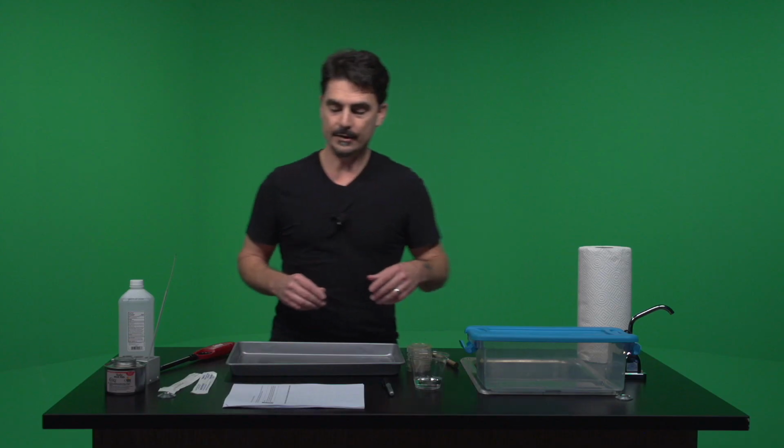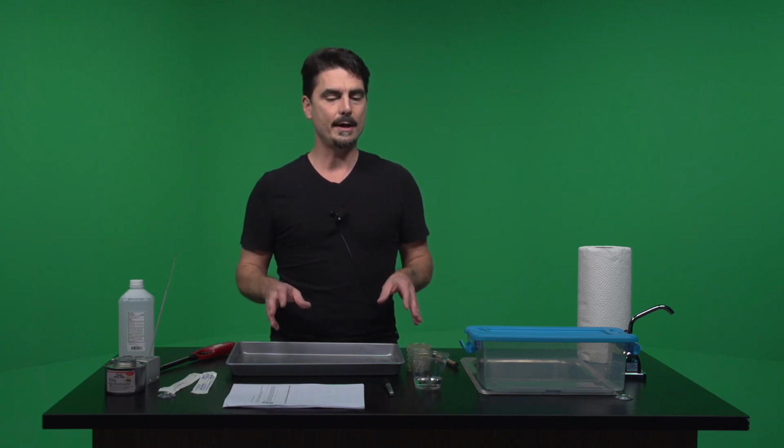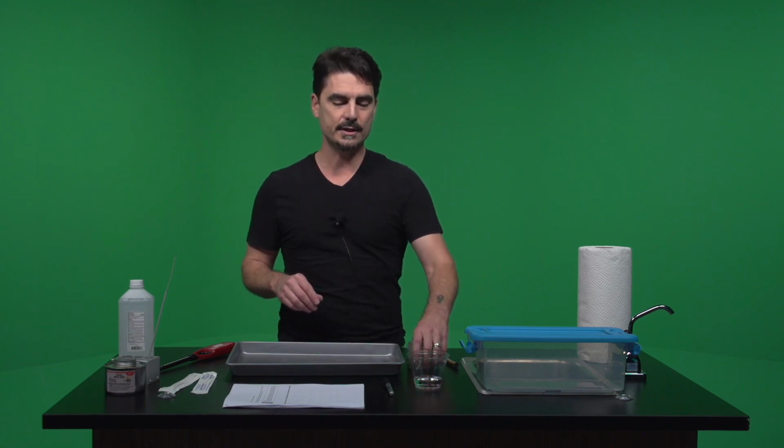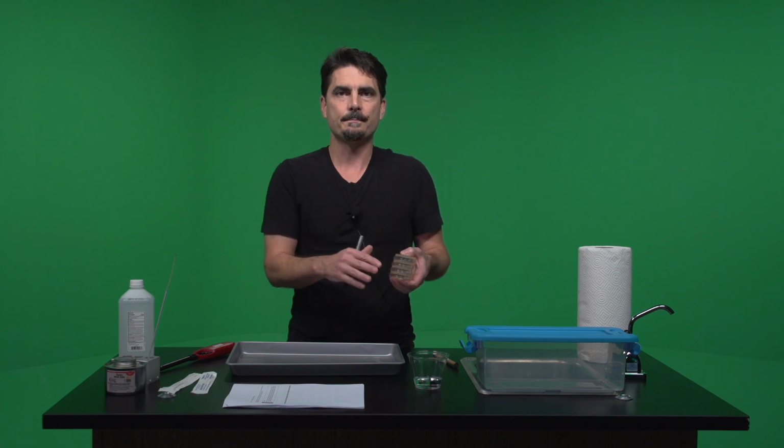Okay, so the next thing we need to do is essentially conceptualize what we're about to do. Make sure that you read your instructions. What the instructions say is we're going to sample from 4 places. You're going to get your feet wet, so to speak, by inoculating 4 plates from 2 human locations and 2 environmental locations.